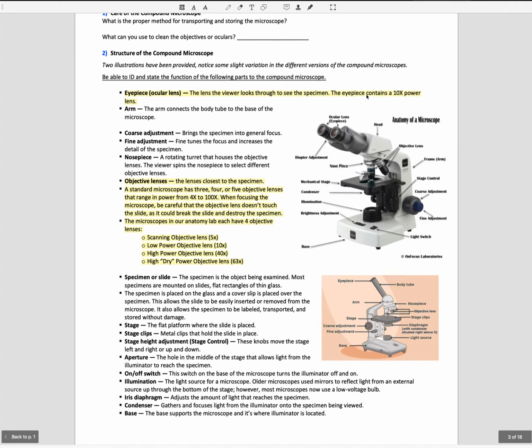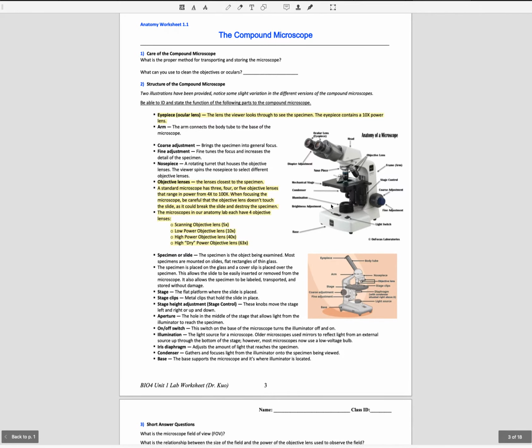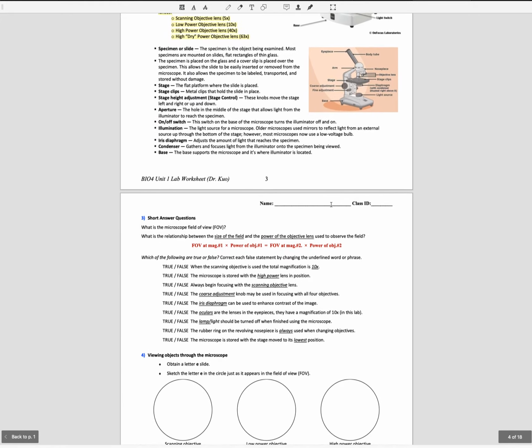And remember the tenfold magnification on the ocular lens. That is information you'll need for the practical to do a calculation. And don't stress out too much about the microscope, because really there are only 2 questions of the 54. So there are 54 questions on the practical right now, and only 2 are on the microscope. In a bit, I'll even tell you what those 2 questions are going to be about.